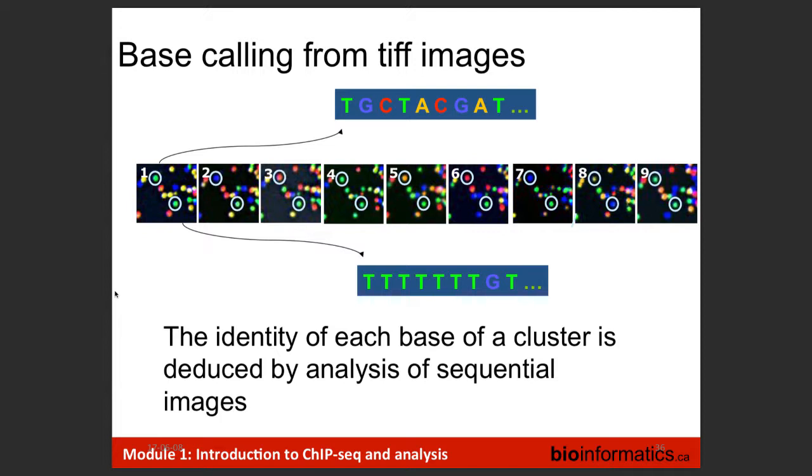Why use 25? Why not just see completely empirically? Because all these images take a lot of space. Ideally, you'd store all of the images and then you do an even better job. But this is actually processed in real time because of the size of the image. So the threshold is set such that you have enough, but then it's processed in real time. And these images are not kept and are not transferred. Once the map is in place, they're processed and information is extracted and those images are deleted.